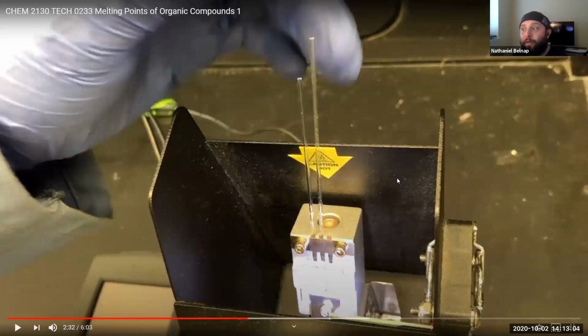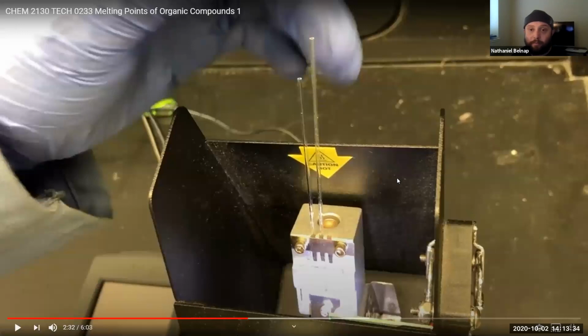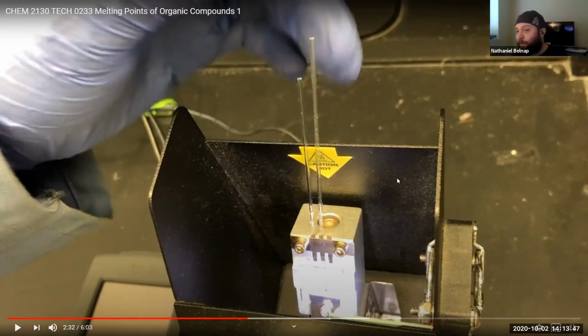Right on. And so if this was an unknown compound, this is all in your lab manual, so if you did read it, you should know this. If you don't know it, what could you do to save time? Heat it rapidly within like 15 degrees Celsius of the melting range. Well, you don't know what the melting range is, right? This is an unknown compound. You just heat it rapidly in general until it melts. That way you have an idea of about when it's going to melt, and then you can do the rapid up until. Right. I knew you knew it.